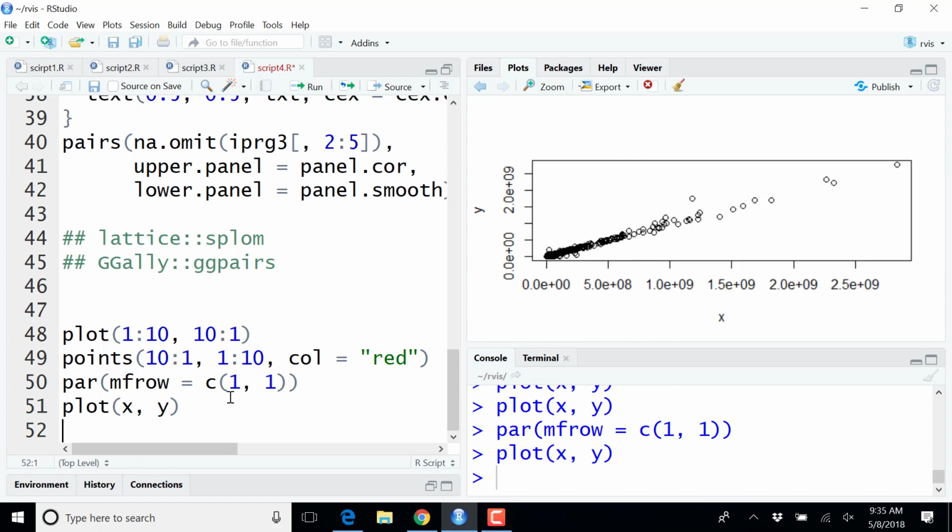And so generally, when we have overplotting, as Stephen alluded to, one way to get around this would be to set an alpha channel. As we have seen yesterday in ggplot2, you can set alpha equals and then a value between 0 and 1. In base plotting, I would define my color.